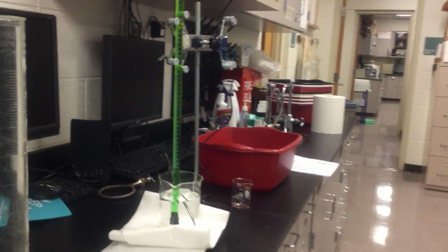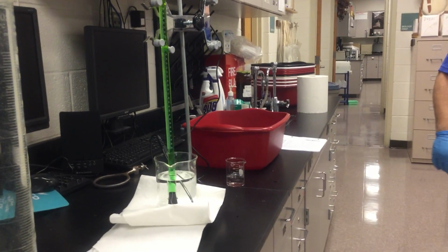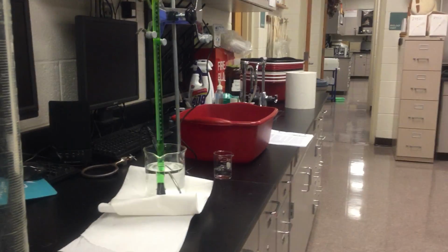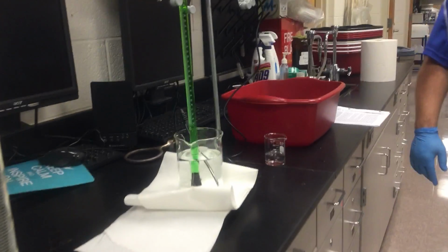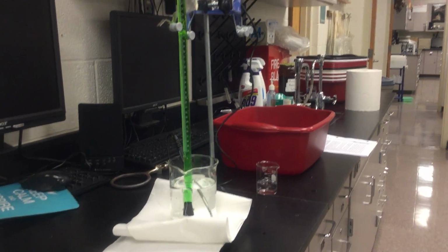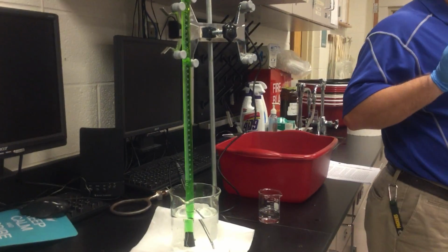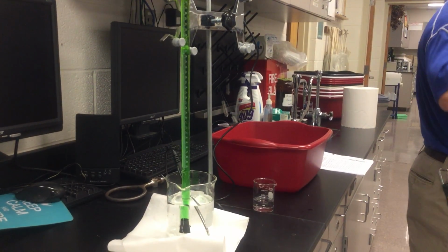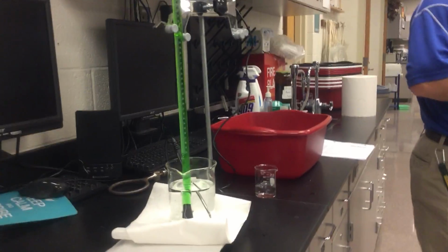So, Sean, right behind you on that computer, turn that computer on and get on the weather channel. While we are waiting for the reaction to take place, Sean's going to call up the weather channel and we're going to get our pressure measurement. Now, something about the pressure, I didn't even know this, okay?